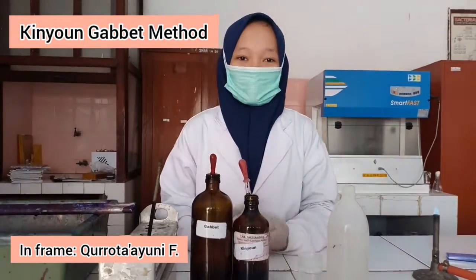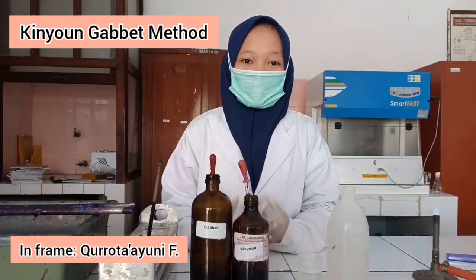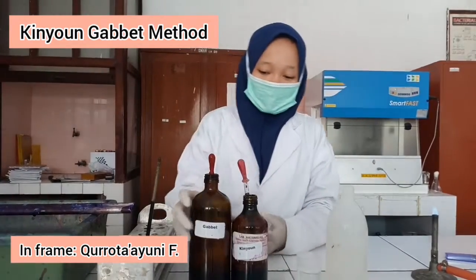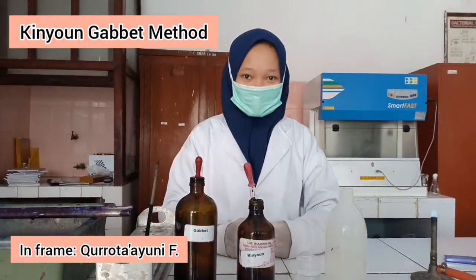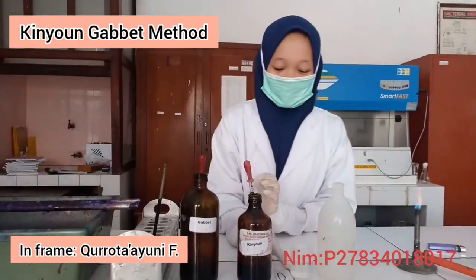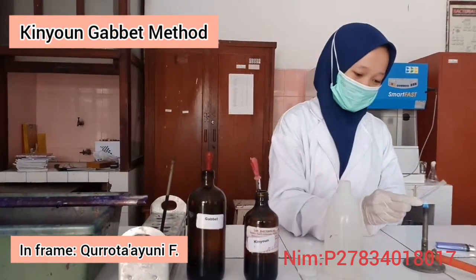The second, I will explain about the Kinyoun-Gabbett stain procedure. The procedure is the same as the previous one, but the reagents used are different. There are Kinyoun reagent and Gabbett reagent. The first step is to prepare an object glass, then fixation.